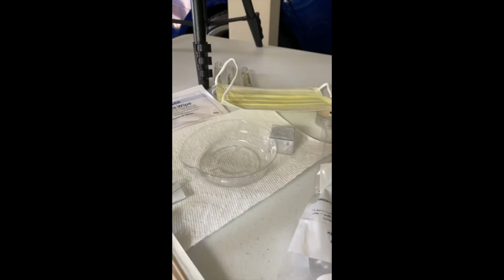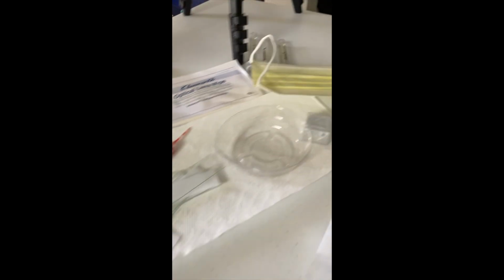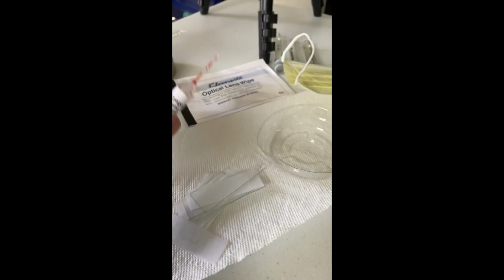So the first part, again, I'm going to collect 2 individual samples from my teeth and gums, and I did want to go over the supplies that I'll be using for this exercise. So let me flip the camera and we'll go from there. So I have my 2 sterile cotton swabs that I'll use to collect the samples from my teeth and gums. These are 6 slides. This is a stain called Congo Red that I'll be using.